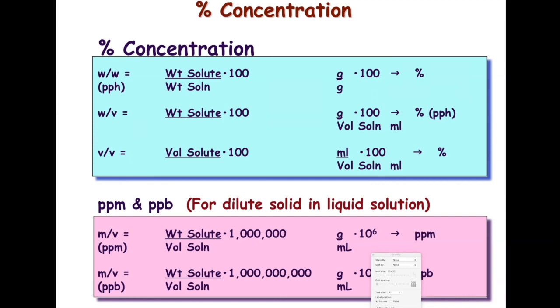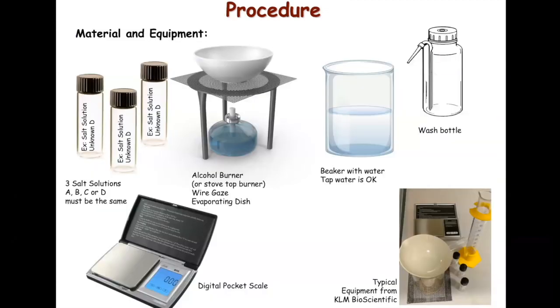So that's why we quote things in ppm or ppb if we need that concentration to be recognized. Okay, so just remember that. So this is your procedure.